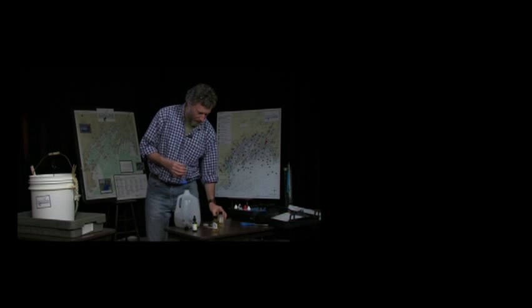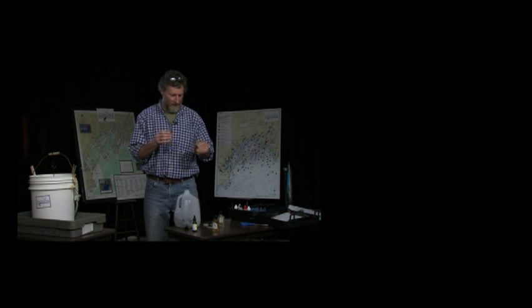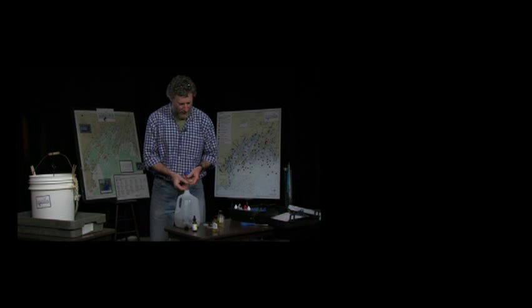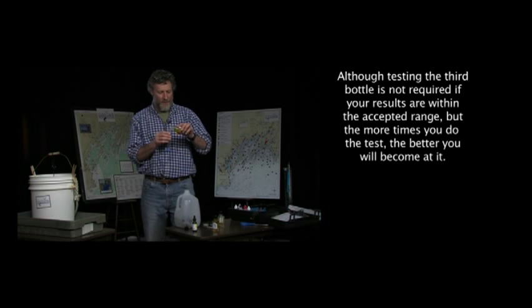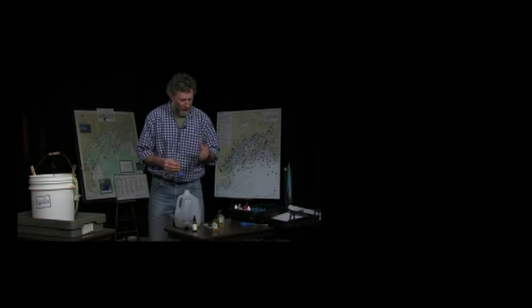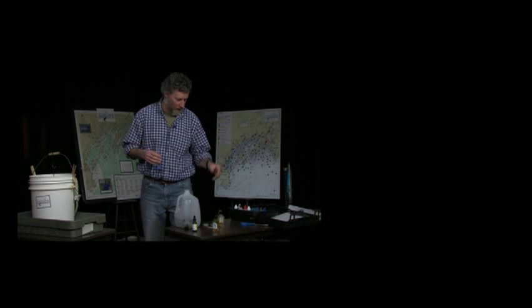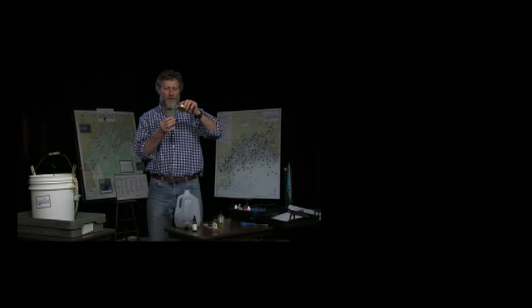But if you have results for your first 2 bottles within 0.6 milligrams of each other, then you're not required to do the third one. We encourage you to do the third one because the more you do it, the better you get at it. And there's a chance that your third bottle might be a little bit closer to one or the other. But if your first 2 results are beyond the 0.6 reading, then we require that you do the third one. If they're not, you don't have to do it.